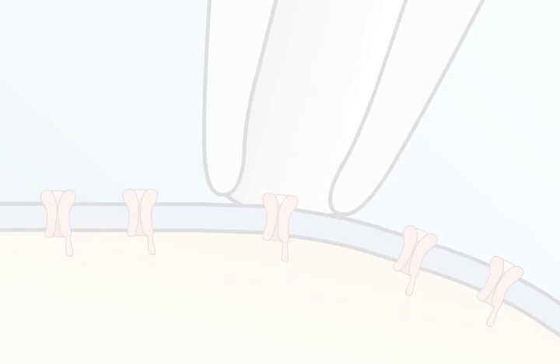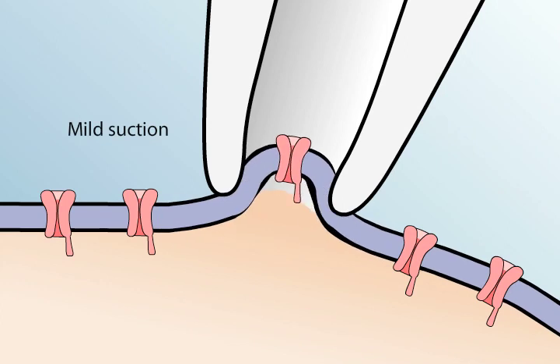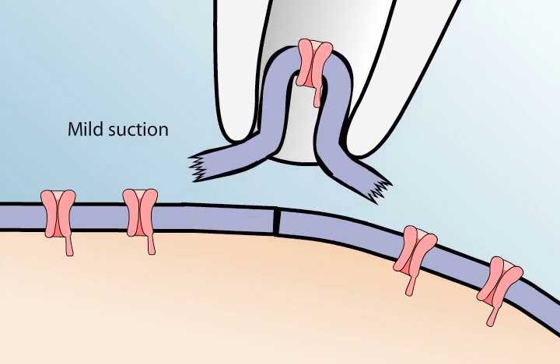Two other variants of the patch clamp method originate from the finding that once a tight seal has formed between the membrane and the glass pipette, small pieces of membrane can be pulled away from the cell without disrupting the seal. Simply retracting a pipette that is in the cell-attached configuration causes a small vesicle of membrane to remain attached to the pipette.